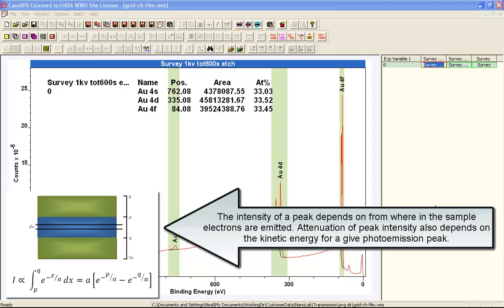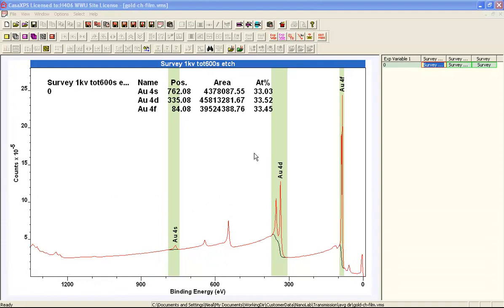In this video we're going to look at how a contamination overlayer can influence a quantification. I will illustrate this using a set of survey spectra that have been acquired from gold.